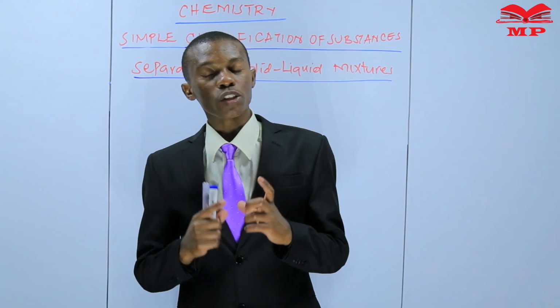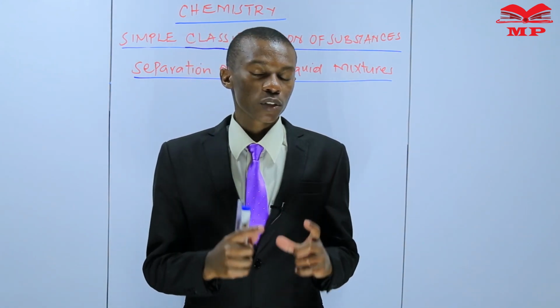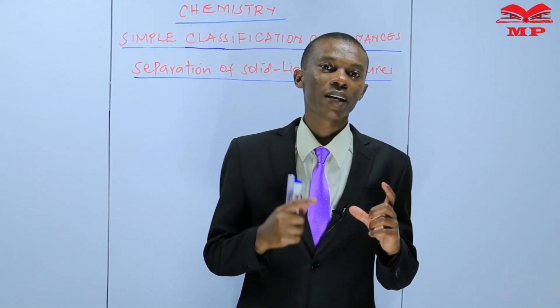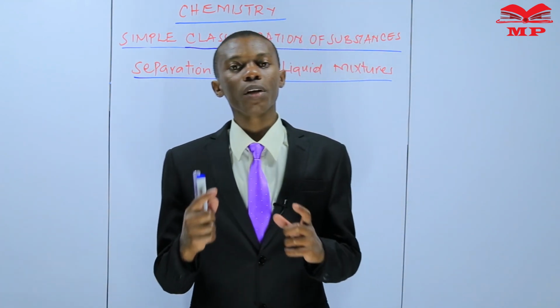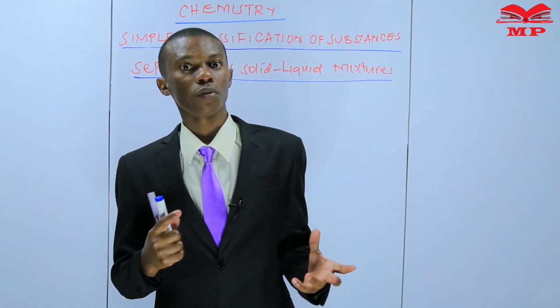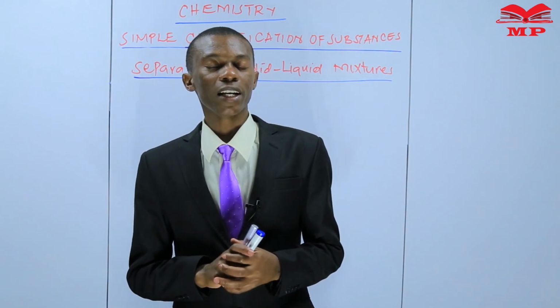This method, we said, is not very effective because some solid particles still pass through in the process of decanting. And that's why we say that decantation is not a very effective method of separation of insoluble solid liquid mixtures.